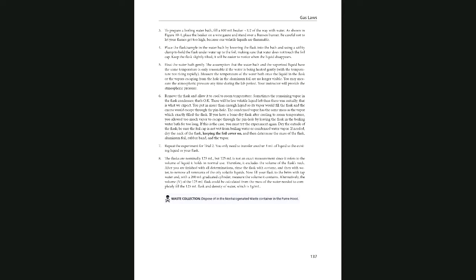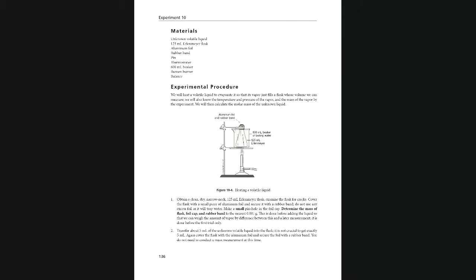Now, to follow the procedure, I'm going to stop sharing this document with you. You have the lab manual that you purchased from VitalSource. You have the ebook for this course, and the purpose of the experiment today is for you to get the data.